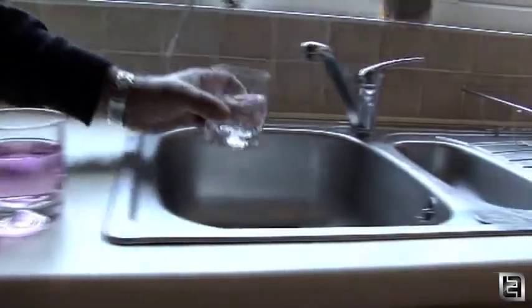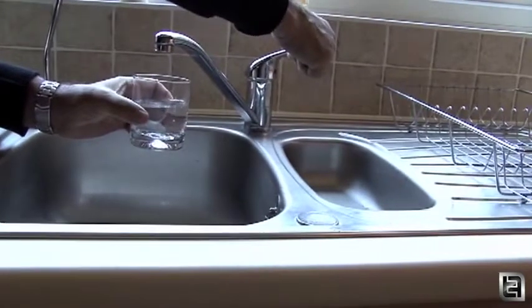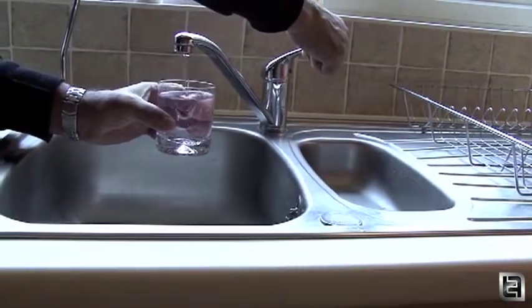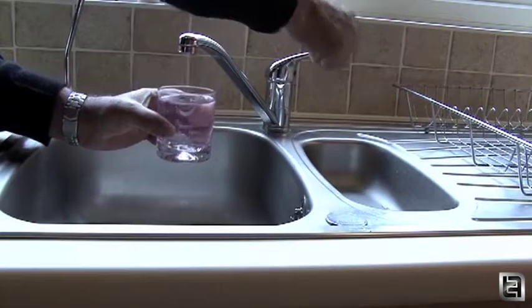Finally, to test the results, we fill the second half of the first glass with fresh mains water. This should now turn a shade of pink, proving that the test that we have just done has not been contrived.